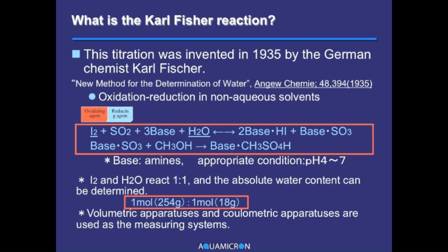The underlined iodine and water react 1 mole to 1 mole in the Karl Fischer reaction and are consumed in equimolar amounts. The weights of 1 mole of iodine and water are 254 grams and 18 grams, respectively. Thus, you will understand that when you observe the weight decrease of iodine, you can calculate the weight decrease of the water. Dr. Karl Fischer noticed this and announced his analytical method for calculating trace amounts of water. This reaction is now called the Karl Fischer reaction.